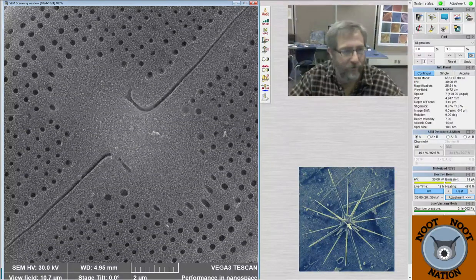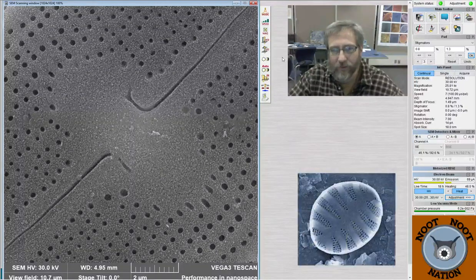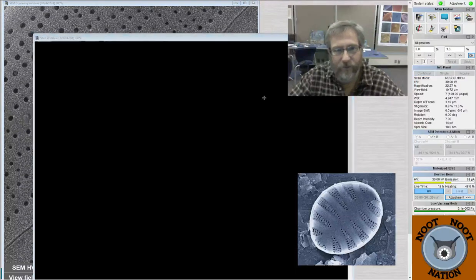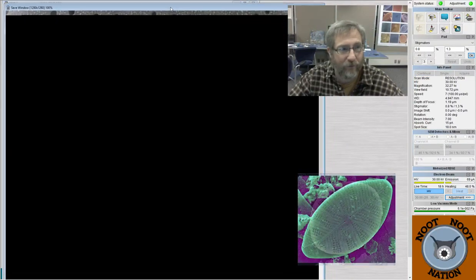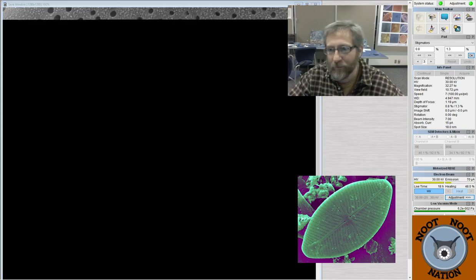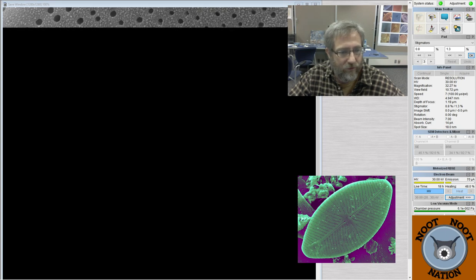I was playing around also a little bit with the image quality, trying to get it as good as possible, as I normally do. I had a little bit more time to do that this morning because I started up the SEM about a half hour ago and started playing with it. Sometimes I don't have much time to get started, but today we do.